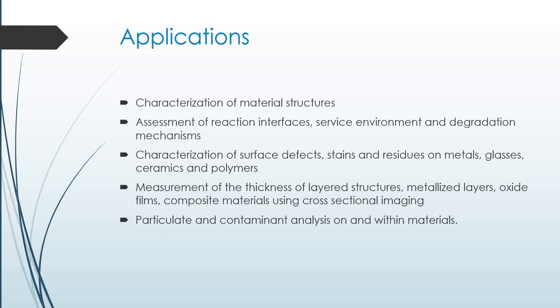Then applications of EDX: characterization of material structures, assessment of reaction interfaces, service environment and degradation mechanisms, characterization of surface defects, stains and residues on metals, glasses, ceramics and polymers, measurement of the thickness of layered structures, metallized layers, oxide films, composite materials using cross-sectional imaging. And last is particulate and contaminant analysis on and within materials.